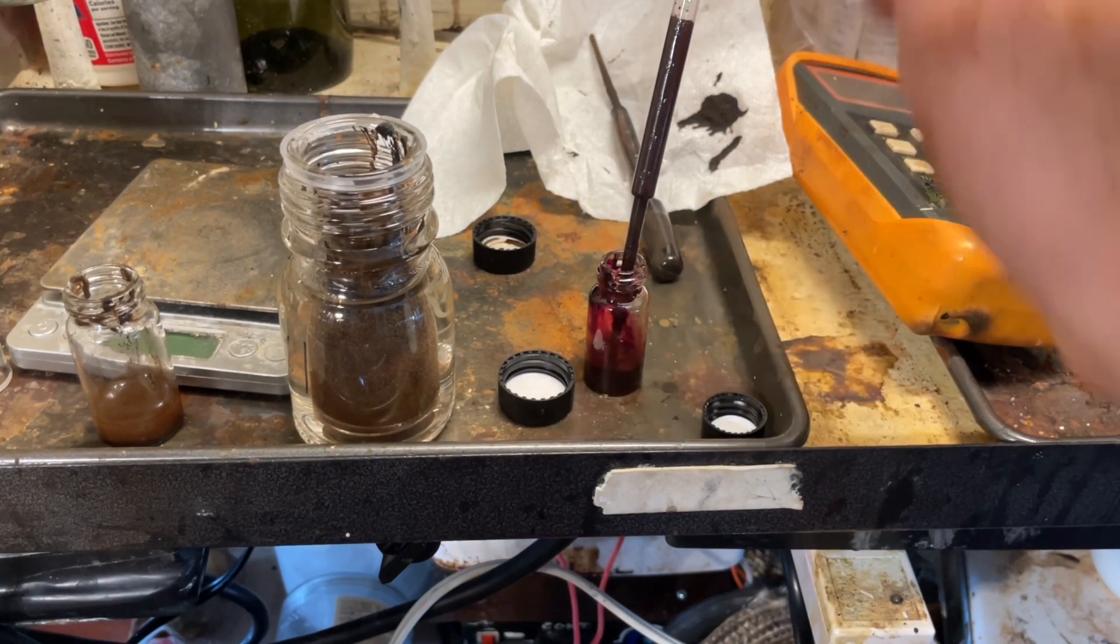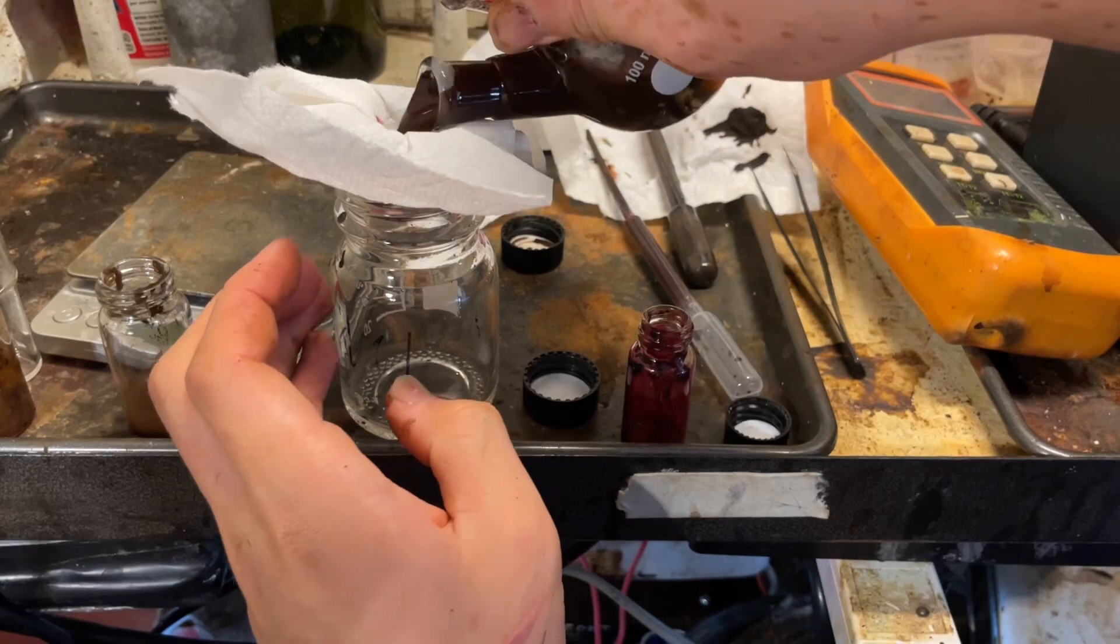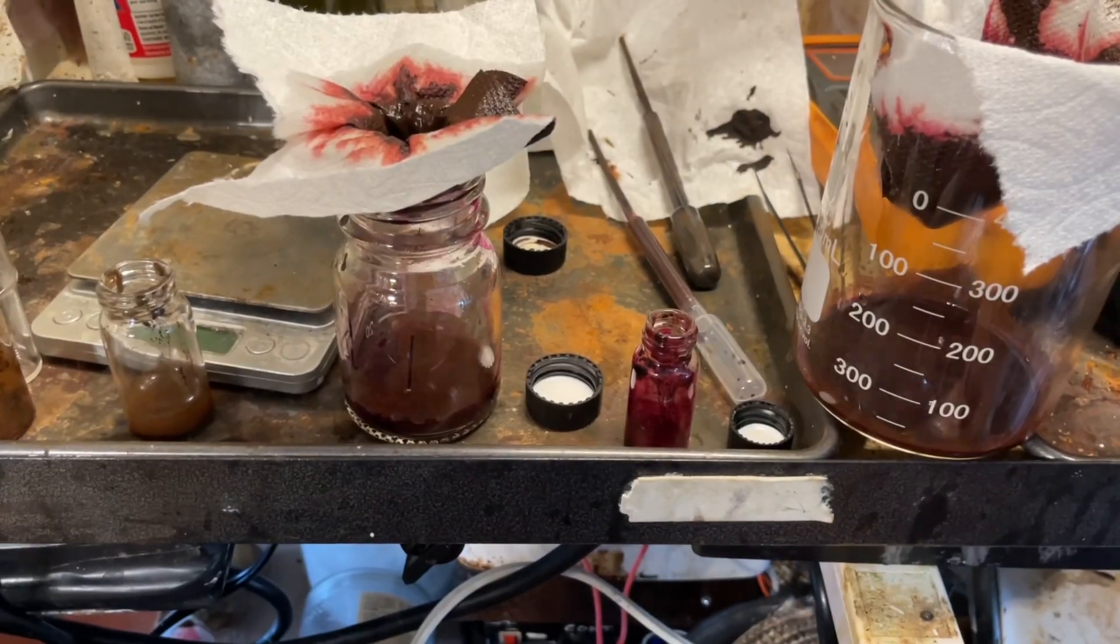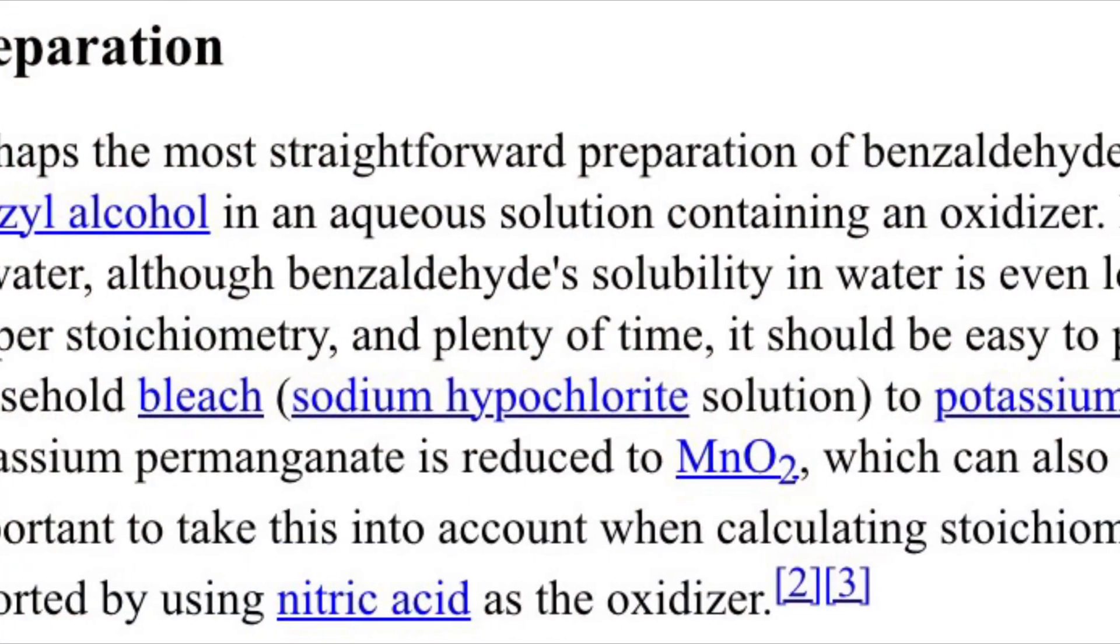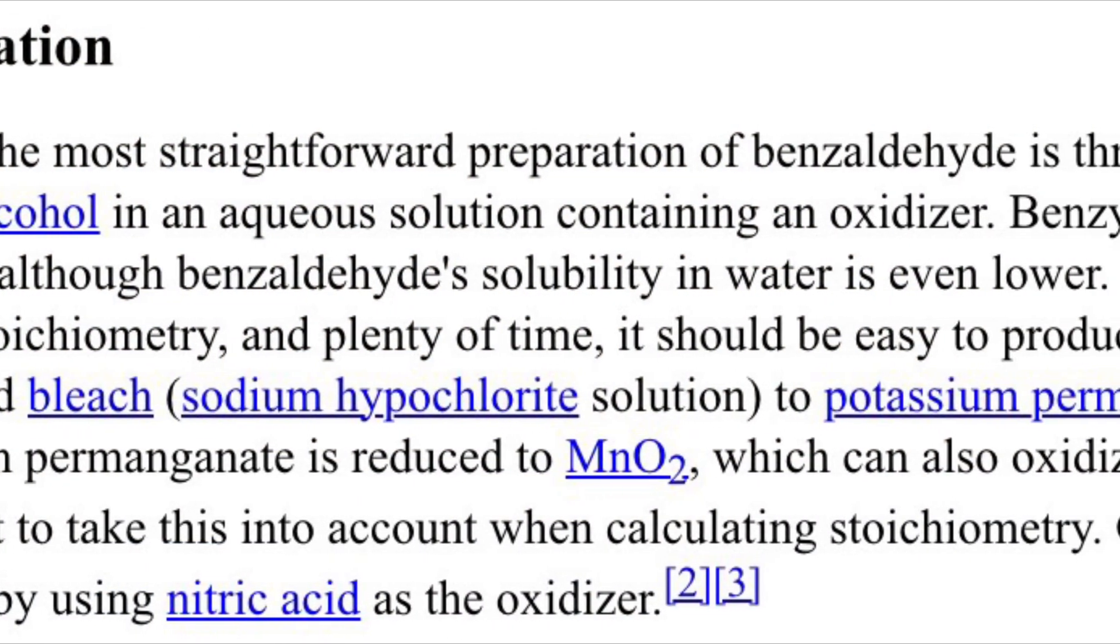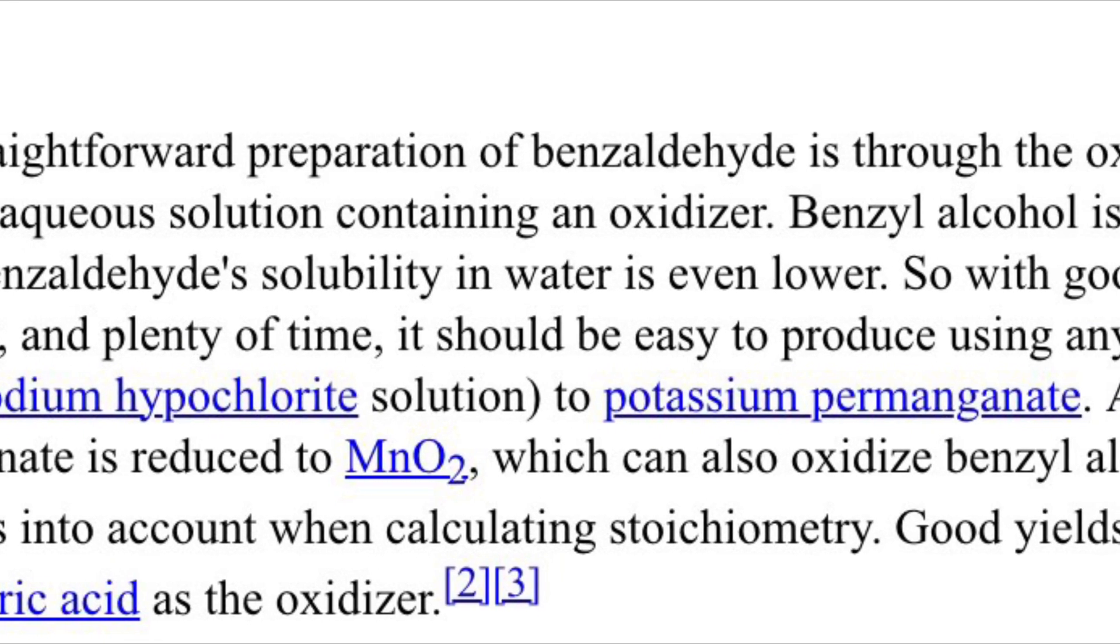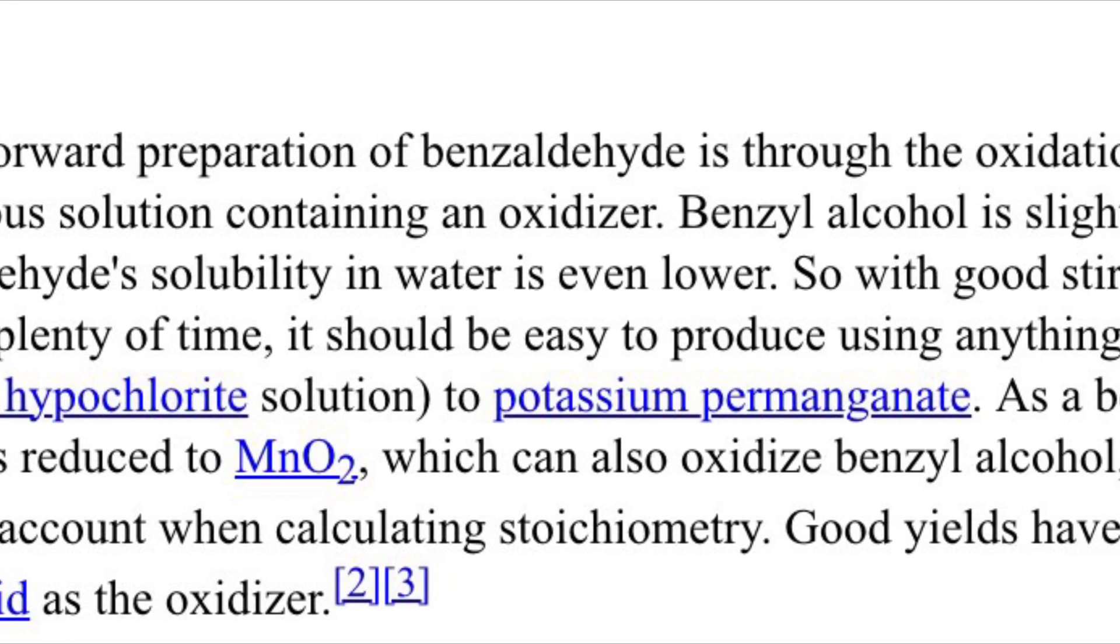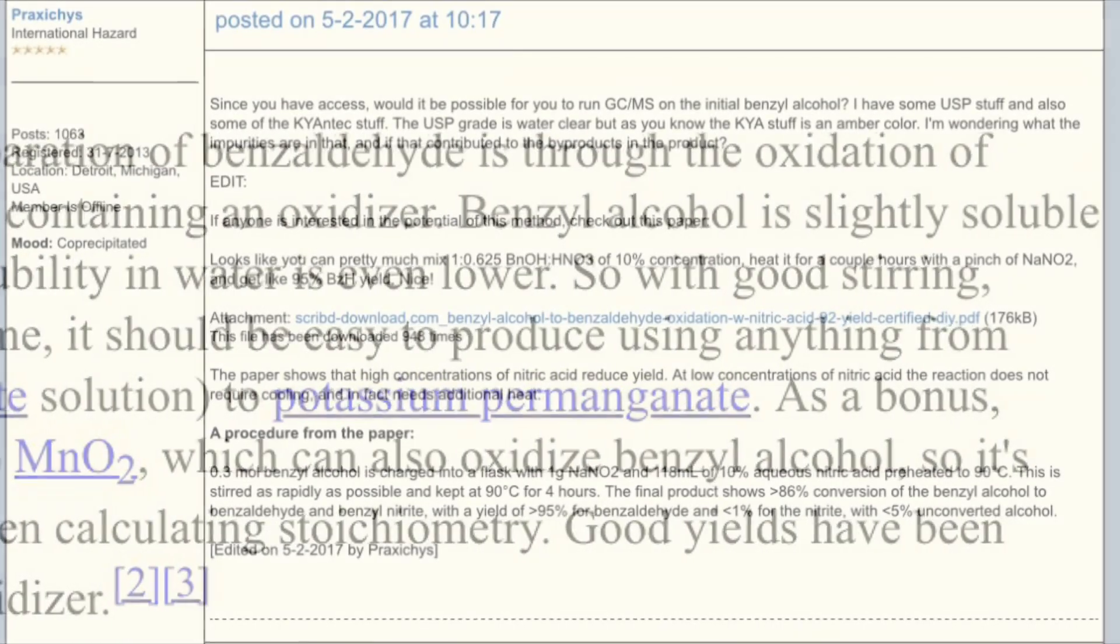So, I think this should be done. So, I think I'll just add it all into, I'll filter it into a flask, okay? Towel filter, because, of course. You know what? I give up. We're not doing this method. We're just gonna use nitric acid. Like I said, my stoichiometry is off, because apparently manganese dioxide itself can oxidize benzyl alcohol into benzaldehyde. Though, I think it would not happen under these conditions that I ran the reaction in, but, oh well.